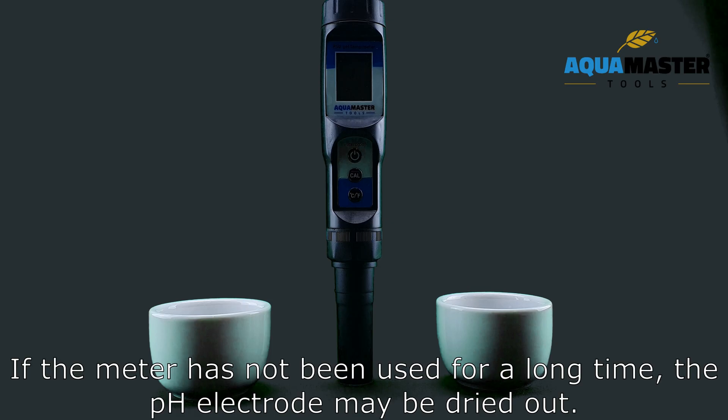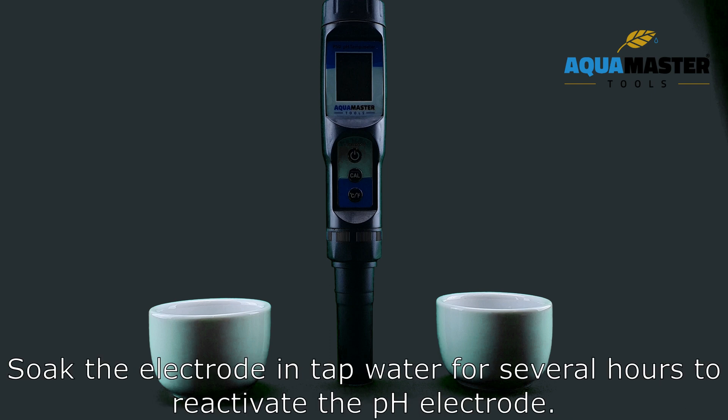If the meter has not been used for a long time, the pH electrode may be dried out. Soak the electrode in tap water for several hours to reactivate the pH electrode.